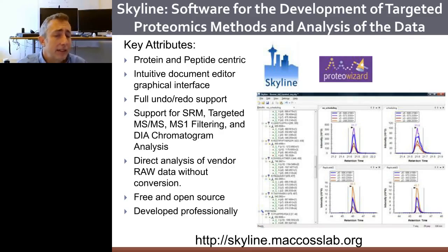Our view of targeted proteomics has changed. We originally talked about SRM, but we've also expanded this to work with some more modern analysis strategies too, that aren't specific to triple quadrupole mass spectrometers, like I had already pointed out.